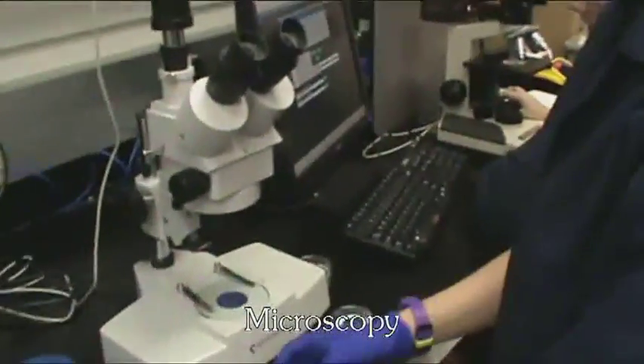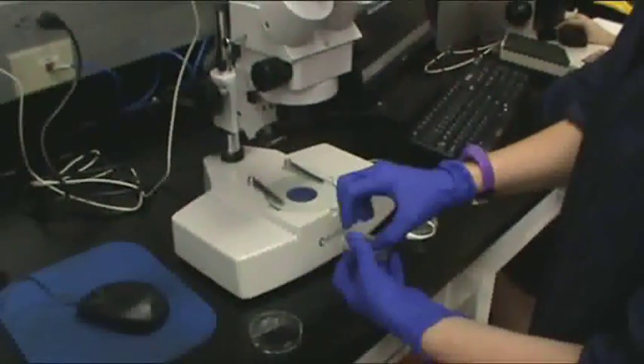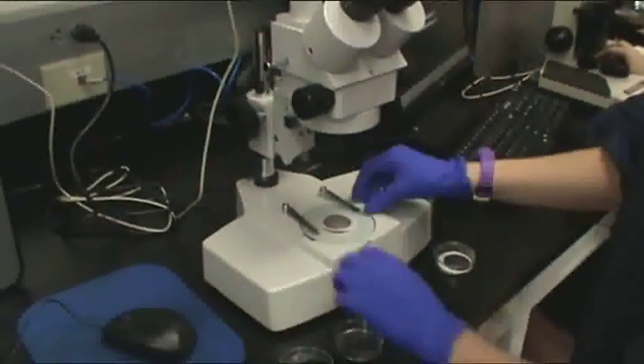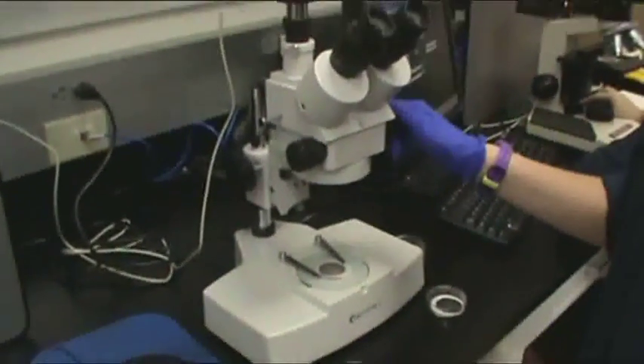Once debris has been gravimetrically weighed and collected on both the 5 and 30-micron patches, we view the 30-micron patch under a microscope. We then capture a representative magnified image of the wear particles found on the 30-micron patch. The image of the wear particles can be found on the report.